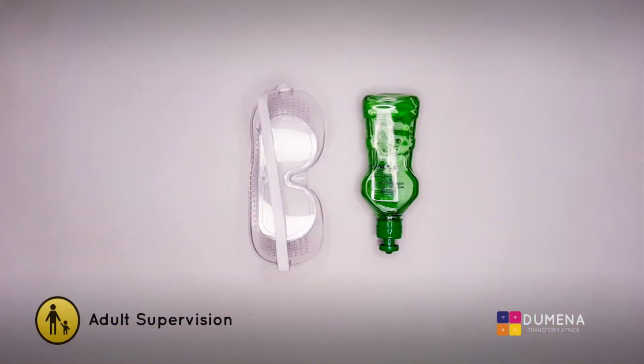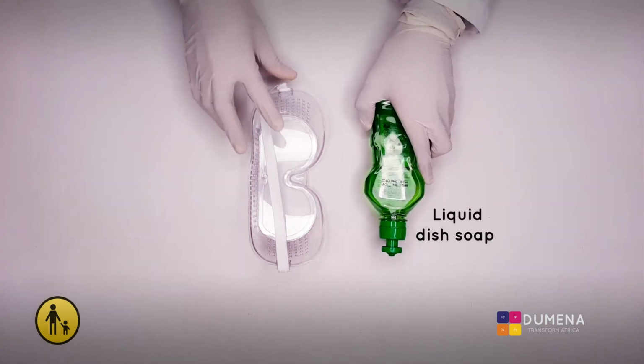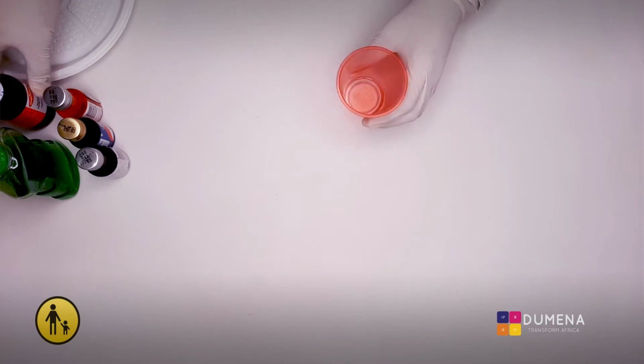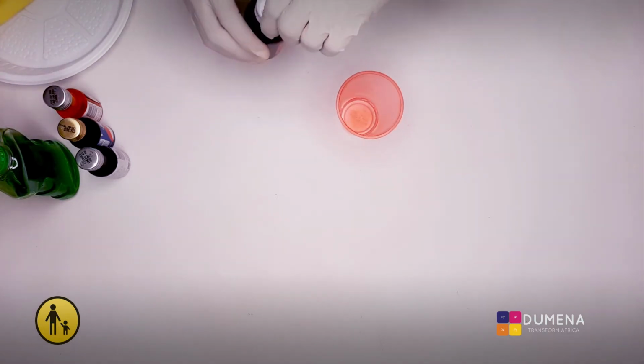Some additional materials you will need for this experiment are liquid dish soap, safety goggles, and of course, a pair of gloves.